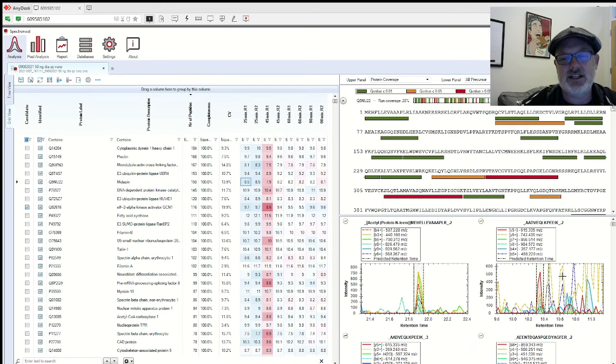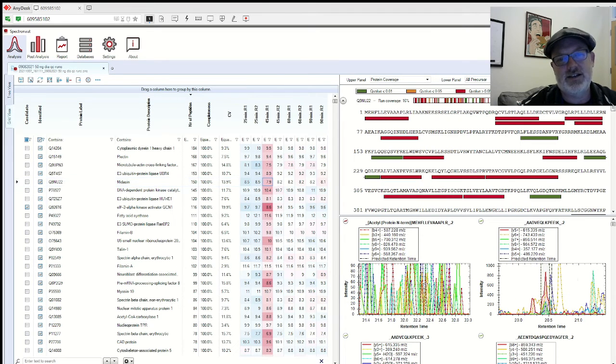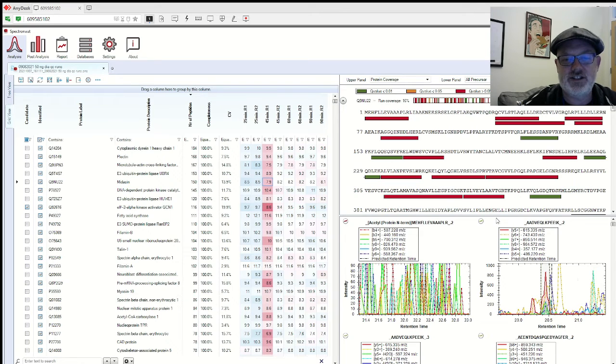We'll go through what transitions look like, but if you click on these numbers, you can look at the data. This is what DIA data will look like for this protein, for example, in this run. As you go through runs, you can see some that don't look very good. This 45-minute run has lots of reds. This run did not work very well. It might have been an autosampler issue or something.